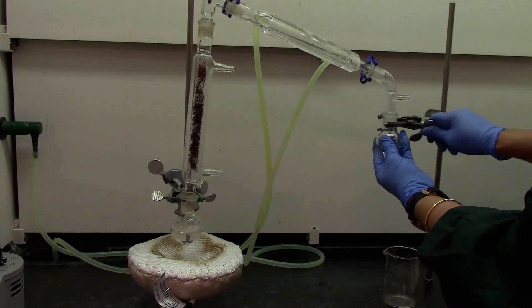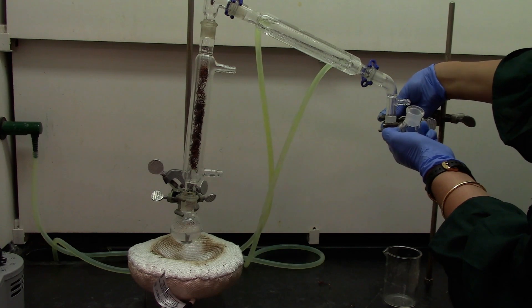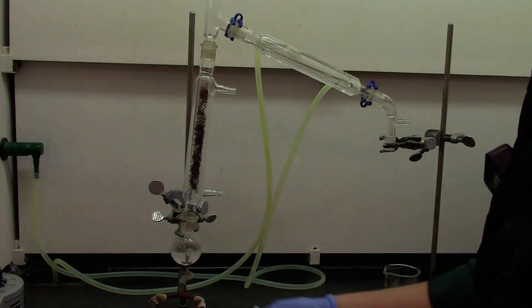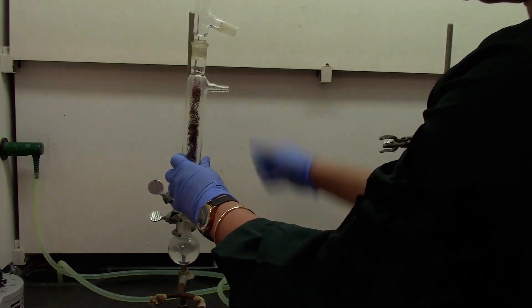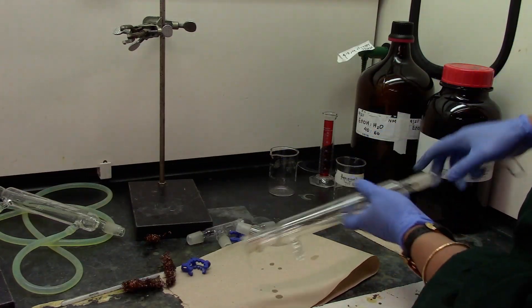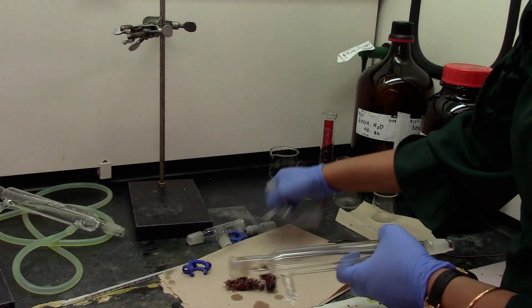We will go ahead and unclamp the collection flask. Let the setup cool off for a few minutes before we start dismantling the setup. The copper turnings can be pushed out from the distillation column and let dry before they can be reused.